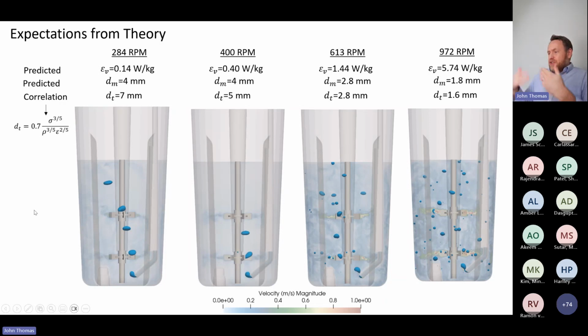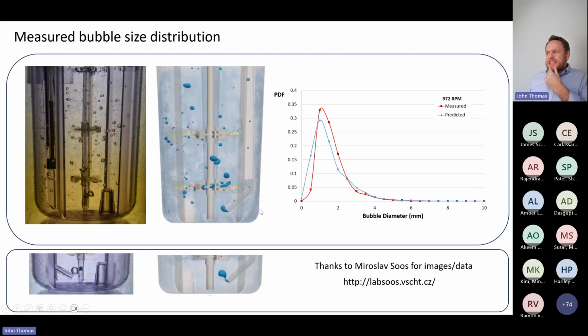But nonetheless, you can see how general this approach is in understanding how these physics evolve through space and time, and it's practical. Yeah, I'm considering smaller lab scale systems here, but it's routine now to be able to characterize systems with this level of fidelity. We can then validate things like a bubble size distribution, as it were. We can take a close look and make sure the bubbles popping out of the sparge are in line. These are cross checks, but it's like a complex elephant. The more we feel the tusks, the tail, the feet, the back, etc., we can confirm that, yeah, we really got the elephant correctly modeled here, as it were. We're not just pointing at the tusks and feeling the sharp and calling it an elephant. We're feeling around conceptually, qualitatively, semi-empirically, etc., and seeing that things check out.